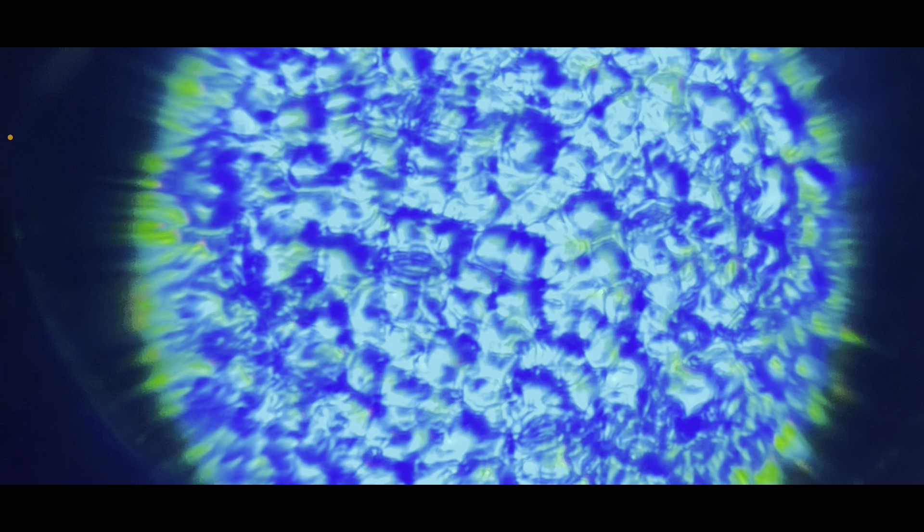Isn't this just so cool? I have no idea how you would describe this — it just looks like a bunch of little hills. Okay, this is gonna sound gross, but if you imagine a lot of eyeballs, this is what it looks like to me — like a pool of eyeballs.